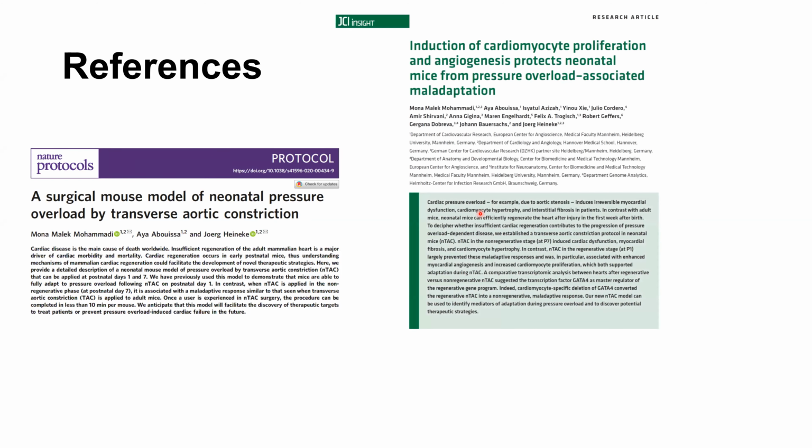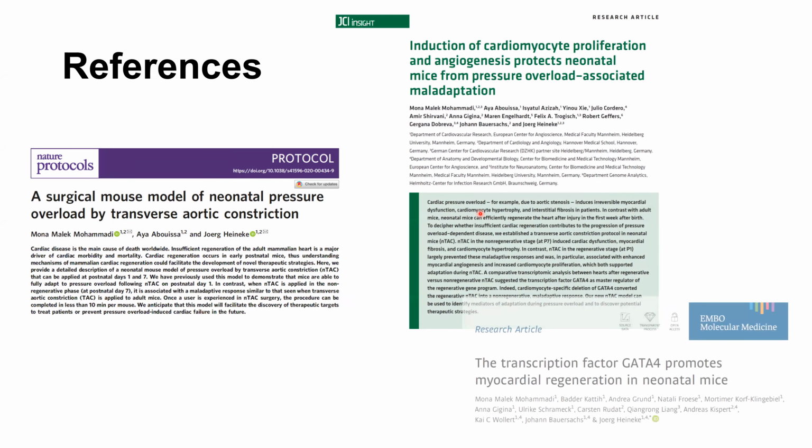For more details about the surgery and procedures, you can refer to my Nature Protocols paper, and you can also see a video of the surgery. And if you are more interested to see the outcome of the surgery, the cellular and molecular mechanism, the role of cardiomyocyte proliferation and angiogenesis, or the role of GATA4 in this adaptive mechanism, you can refer to my JCI Insight paper. And if you want to know more about GATA4 and its role in the regeneration ability of neonatal mice, you can refer to my EMBO Molecular Medicine paper.